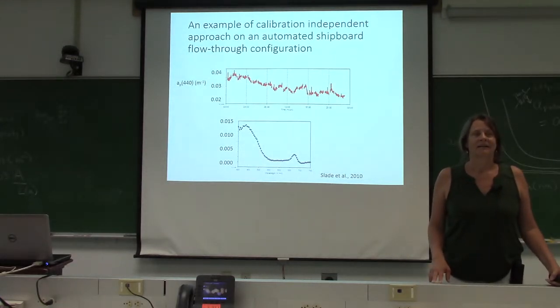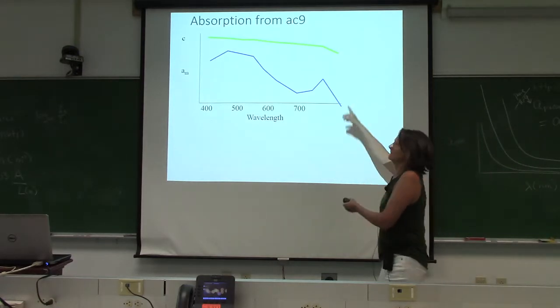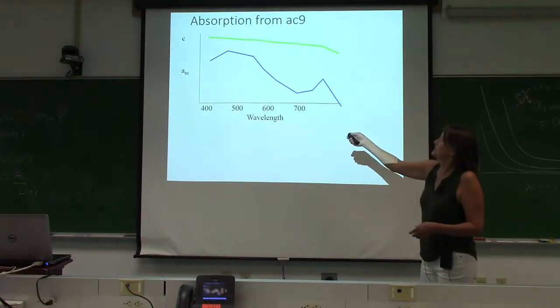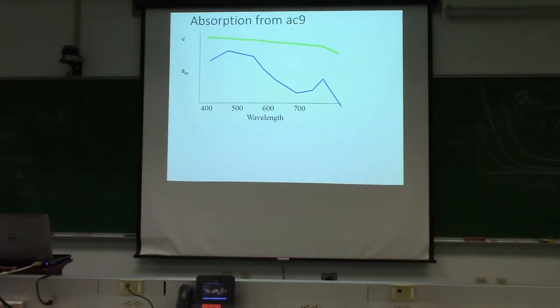Another thing is, in the process of this work, we discovered that you can use the deviation of the spectra from what you expect, and you see it with your calibration, to tease out the temperature. The resolution of the ACS is such that you can actually use it to calculate the offsetting temperature, which is quite hard to do. So you can either do it with beam C, which you know is going to have a relatively monotonic decrease, or, as he's saying, if you have the dissolved absorption uncorrected, you know that this should look like this. So you can use that deviation in absorption to work out what your in situ temperature is, and then use that to correct your total absorption and attenuation.